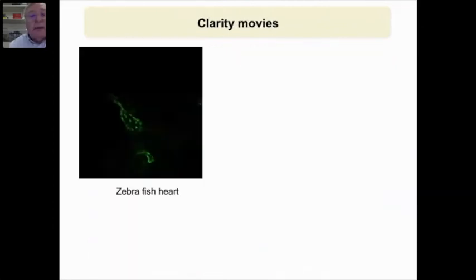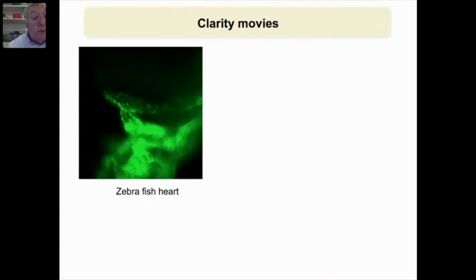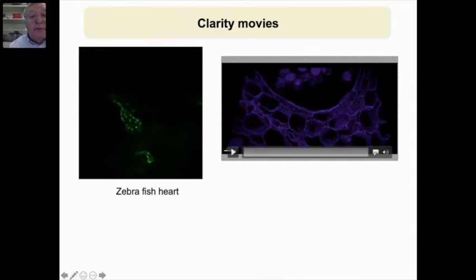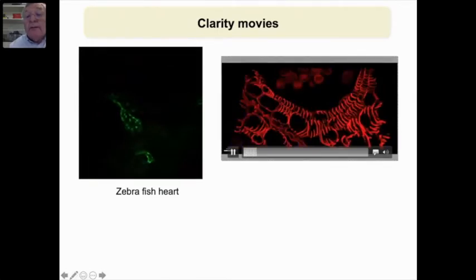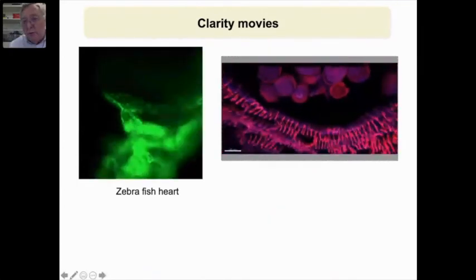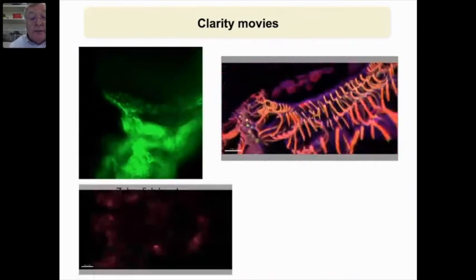It can also get things moving quite quickly. So here is a zebrafish with its heart beating. Now, the other thing the Clarity can do, apart from the conventional, it can take the confocal. So what was being shown to start off with was the confocal image, and then switching to the conventional a bit later on. More of these videos, because they're quite pretty. This is a brassica thing. You can get these really rather nice 3-dimensional images, and more and more.